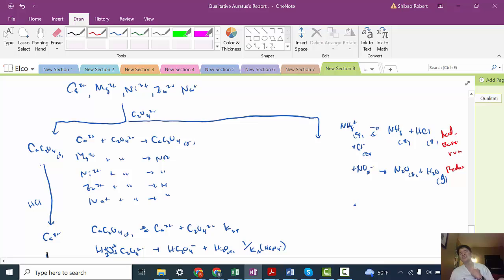Here, ammonium has an oxidation state on nitrogen of -3, and nitrate has an oxidation state on nitrogen of +5. So this is the removal of ammonium. Okay, heat to remove ammonium.